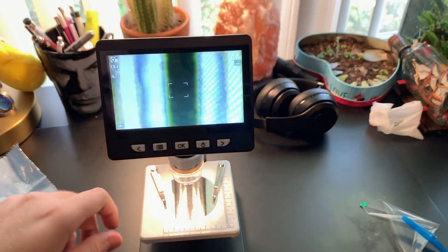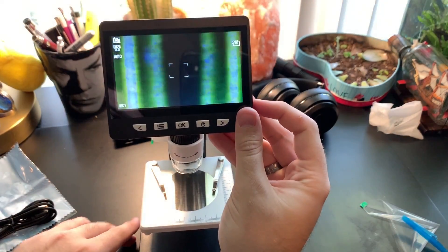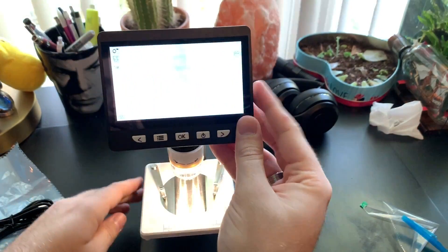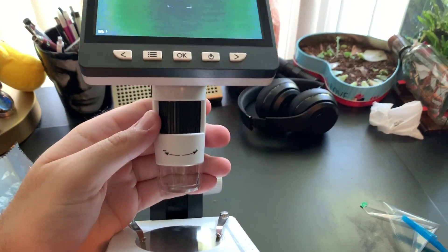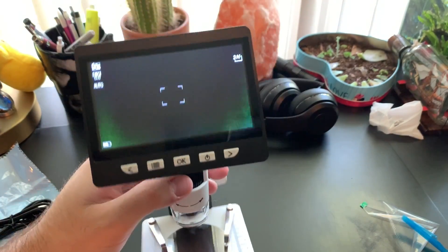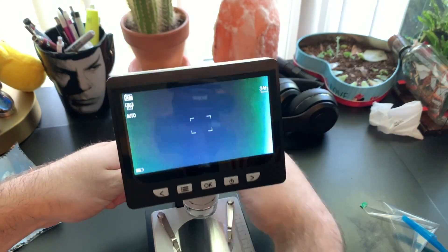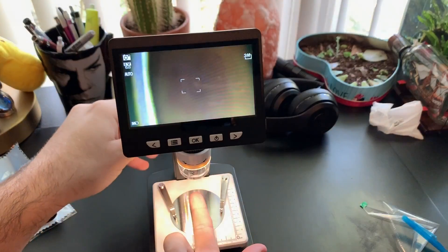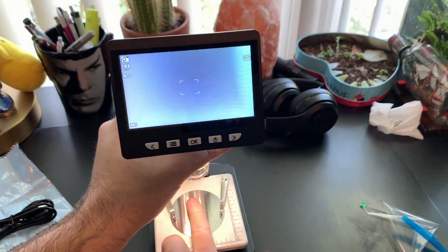The screen comes on, and you can see the LEDs. Turn the brightness dial down and it gets lower, turn it up and it gets higher. The really important control is the focus adjustment ring — less focus one way, more focus the other. Get your finger under the microscope and this helps you focus it, as you can see — it changes the focus as you turn it.